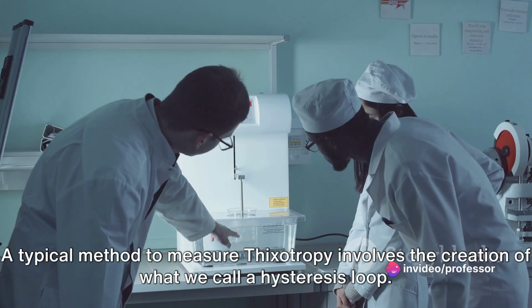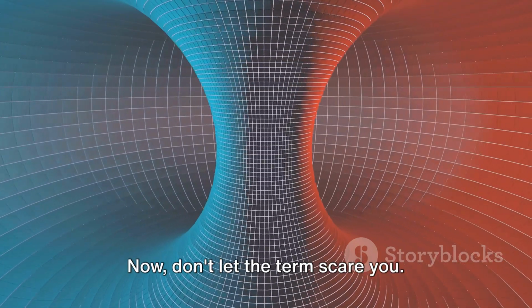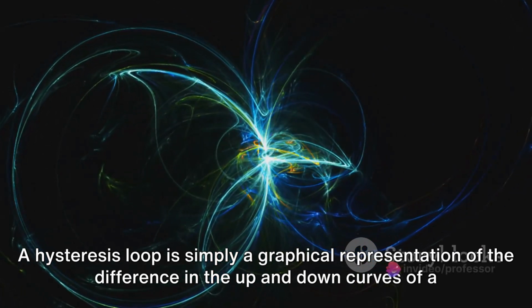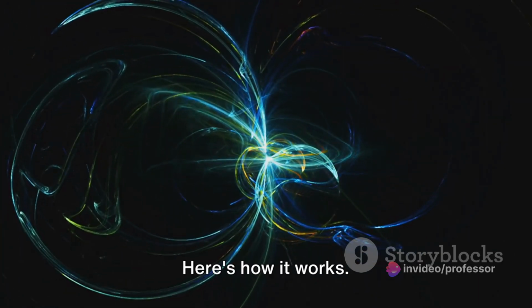A typical method to measure thixotropy involves the creation of what we call a hysteresis loop. Now don't let the term scare you. A hysteresis loop is simply a graphical representation of the difference in the up and down curves of a substance's viscosity as it is sheared and then allowed to recover.